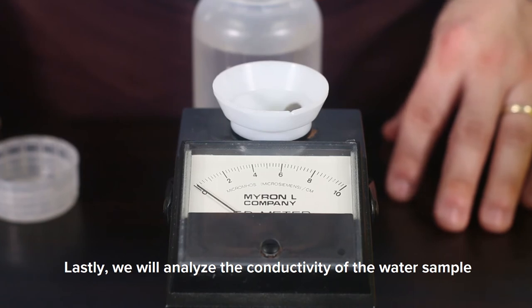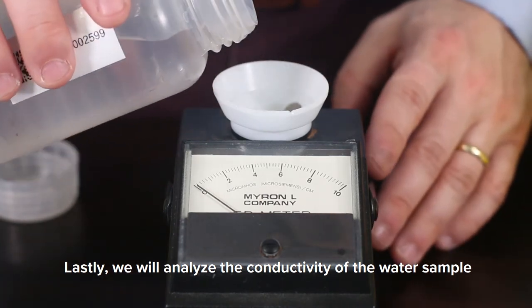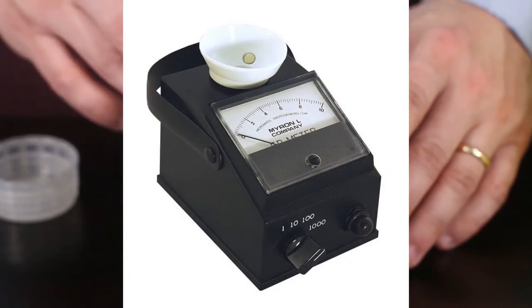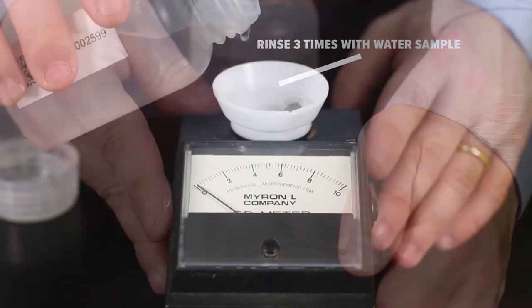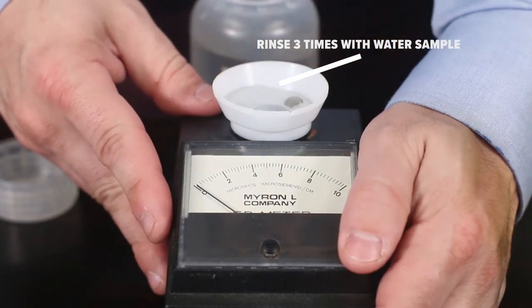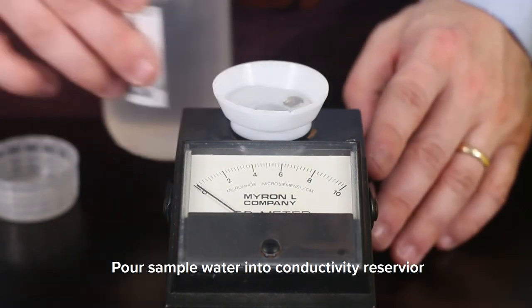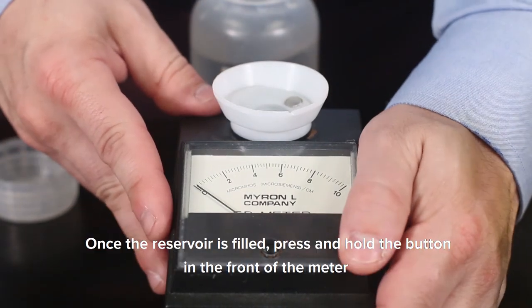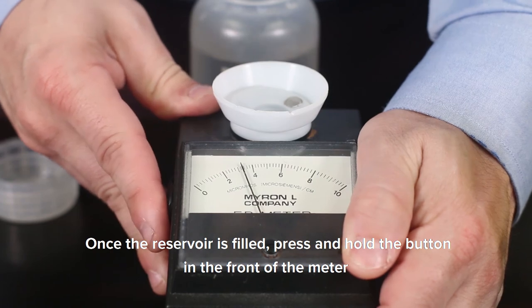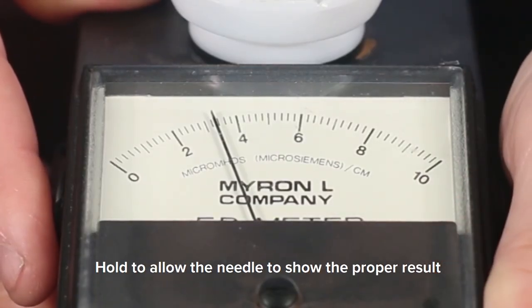Lastly, we will analyze the conductivity of the water sample. In this demonstration, we will be using an analog meter. Fill and rinse the conductivity reservoir three times to ensure an accurate reading. Pour sample water into the conductivity reservoir. Once the reservoir is filled, press and hold the button in the front of the meter. Hold to allow the needle to show the proper result.